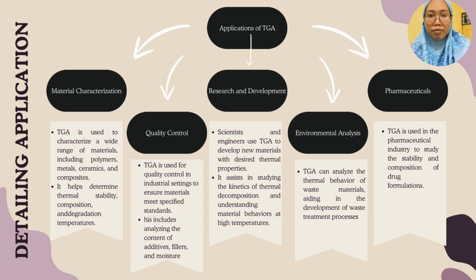Number 3 is research and development. Scientists and engineers use TGA to develop new materials with desired thermal properties. It assists in studying the kinetics of thermal decomposition and understanding material behavior at high temperature.